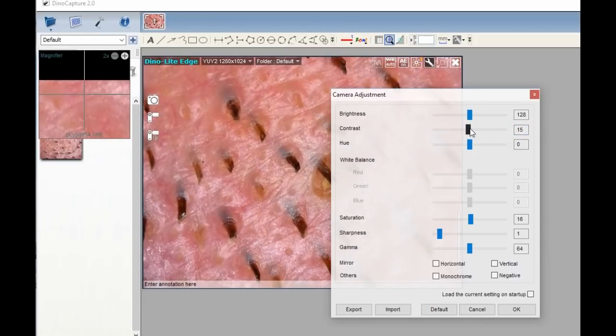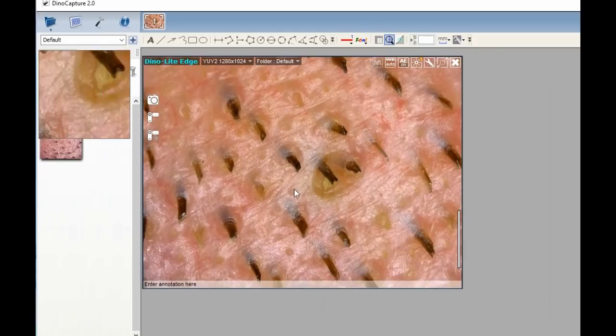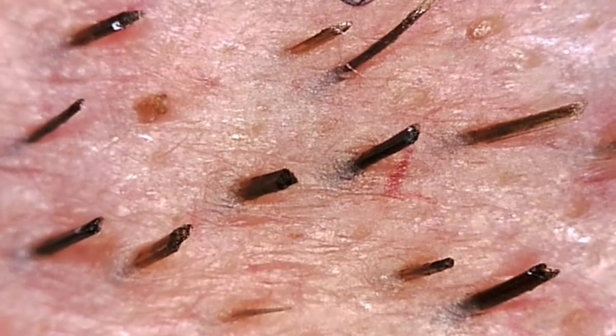In this case, I'm looking at my upper lip at about 80 to 100 times magnification. So I want to set the colors — the hue, the saturation, all that stuff — to generally match my skin tones.